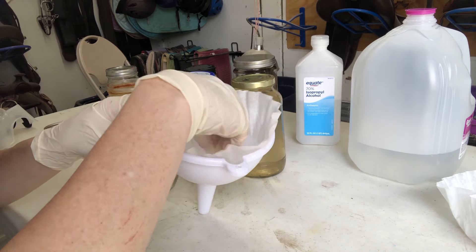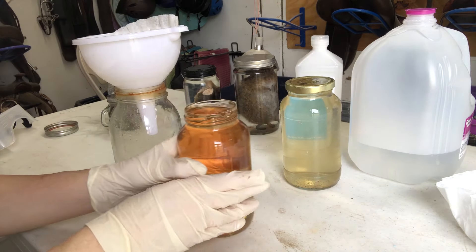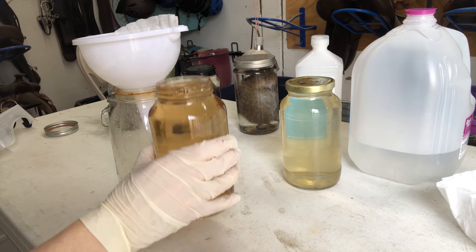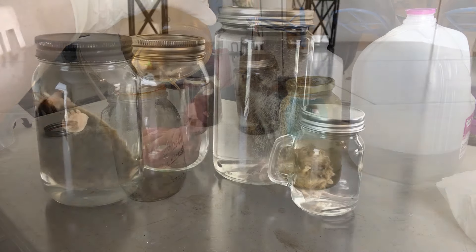Here I'm going to go ahead and filter out my used formalin so I can save it for a different project. I don't have anything on the schedule right now but you never know — just try not to spill. They are all done.